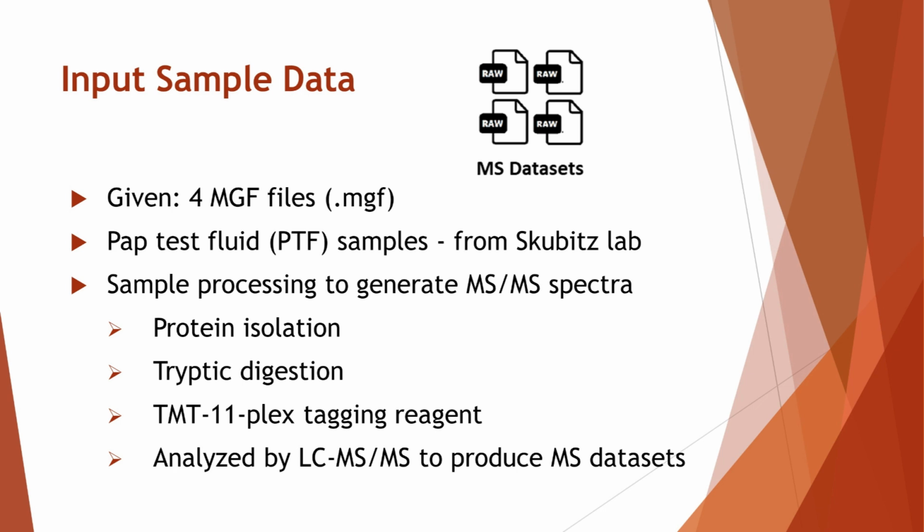These data originated from Pap test fluid or PTF samples that were collected from ovarian cancer and non-ovarian cancer patients. We thank Dr. Amy Skubitz and her lab at the University of Minnesota for allowing us to use this data for this demonstration. I will summarize the sample processing for these datasets.